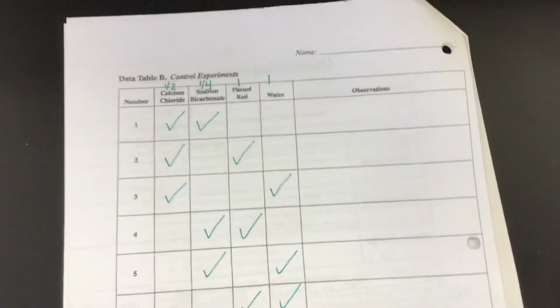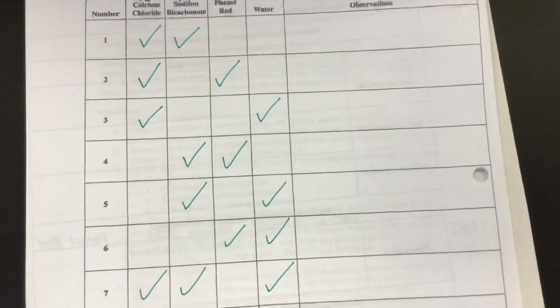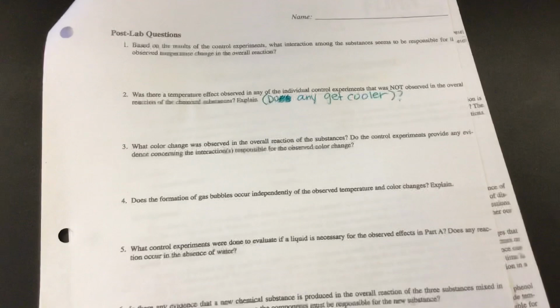All right, so at this point, you should have filled out this entire slide. So under all of those observations for each of those, and feel free to go back, rewind, replay any of them, but make sure you wrote down all the observations. Don't just write down one. Look at color changes, temperature changes, if a gas formed. The very last page or the last slide is your post-lab questions.